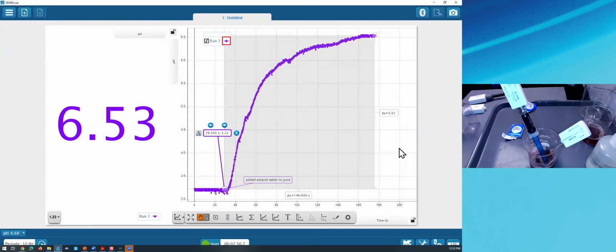All right. Barbara asked a question about rates of change. She noticed that the rate of pH change seems faster at the beginning and slower at the end. So that raises another question: can we get rates from our data? One of the ways we can look at rates is to make a linear fit to our data. There's a tool here that analyzes multiple data points, instead of something like the coordinates tool that analyzes single data points at a time.